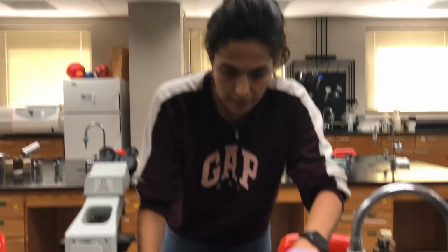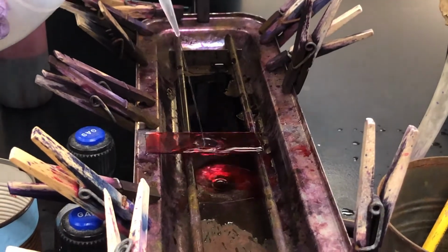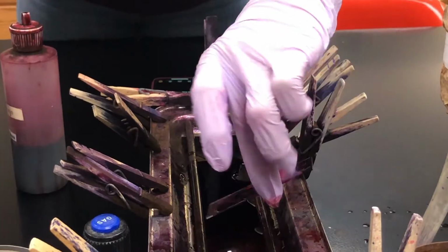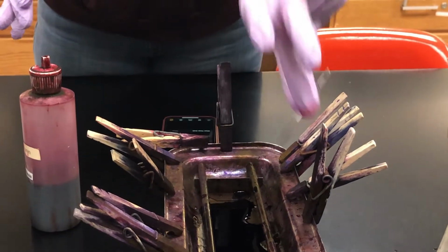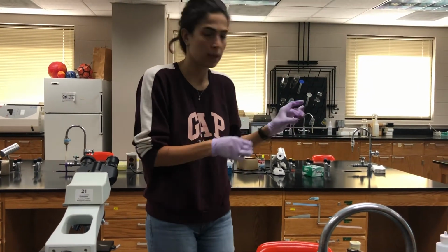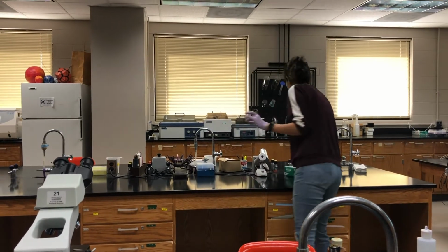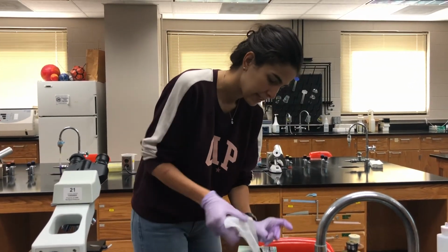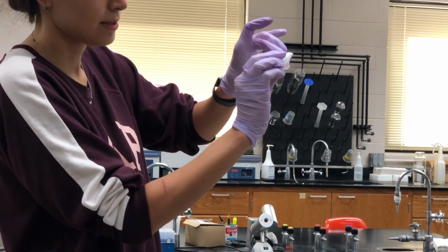1 minute is done. We are going to wash it with water. Okay. And then we need to blot dry. So I prefer to do it with the wipe because this is softer than the paper towel. What we are going to do is just like this.